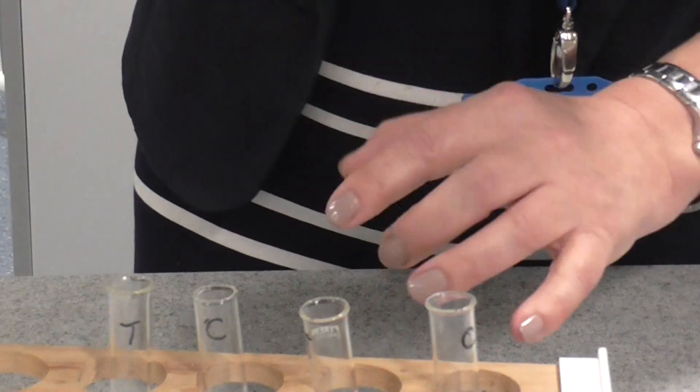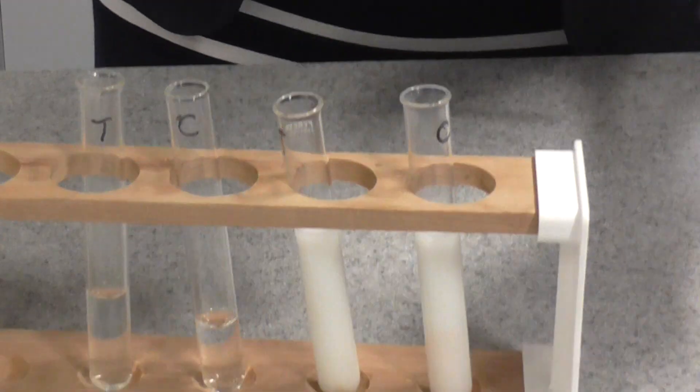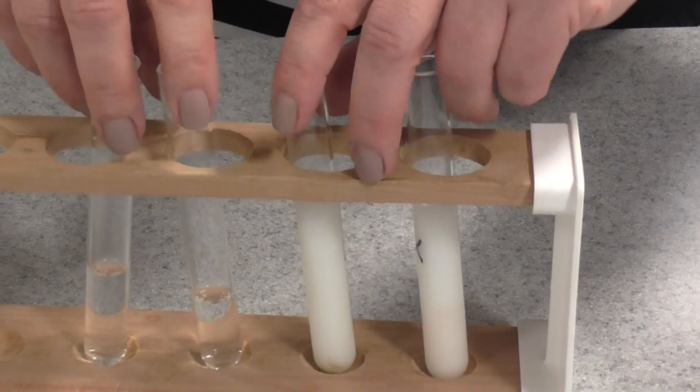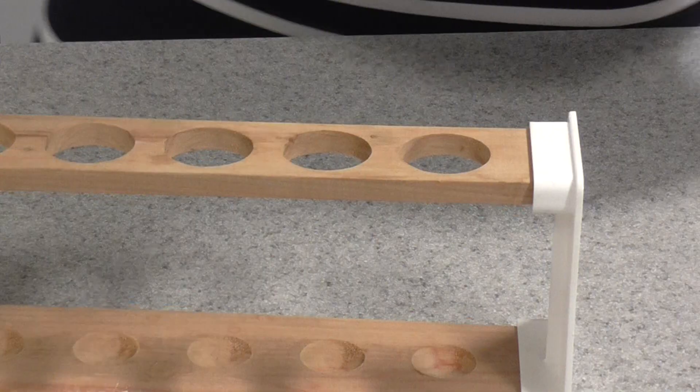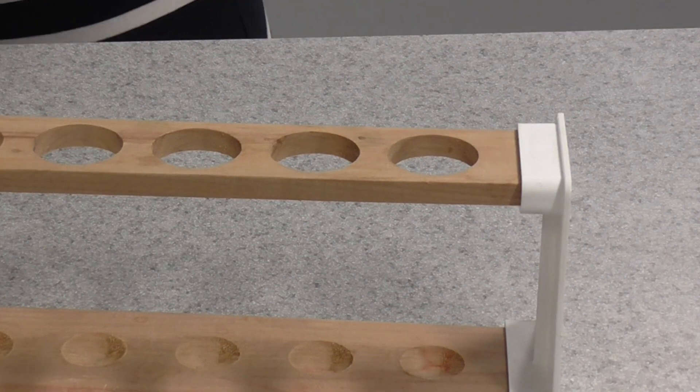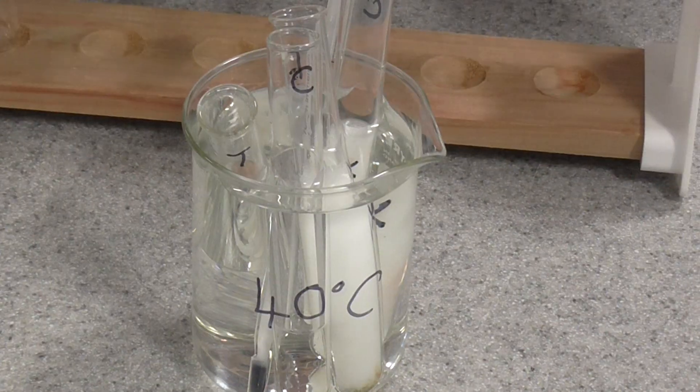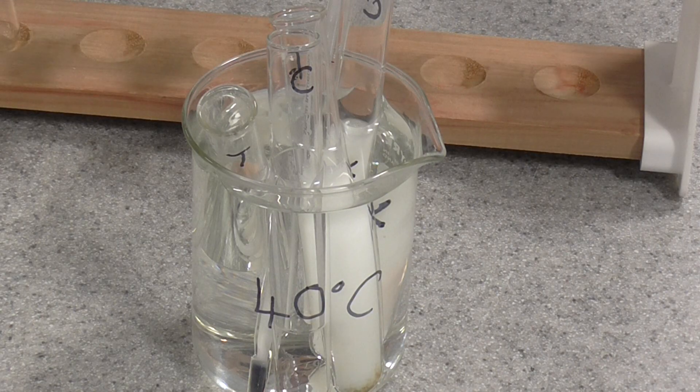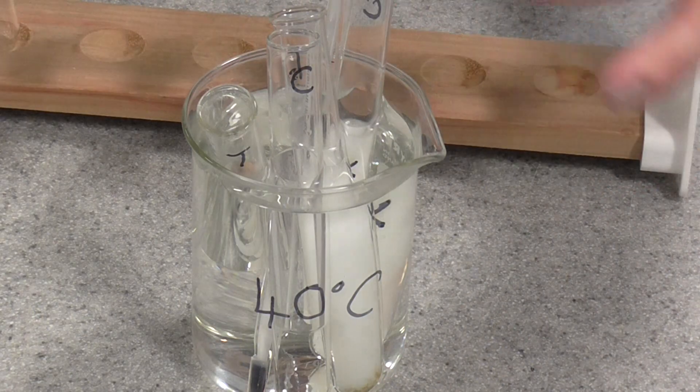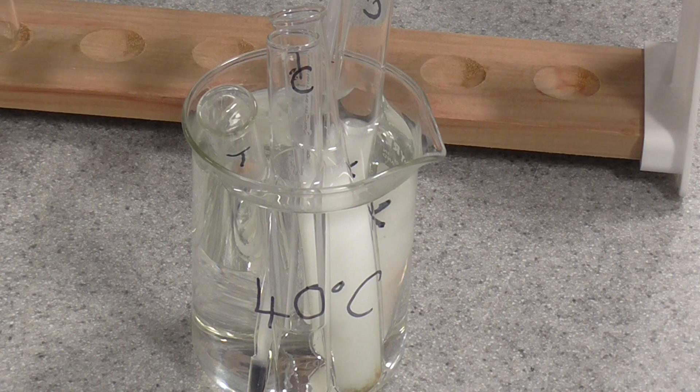Before we mix the enzyme and the milk, we need to make sure that everything is at the right temperature. So you're going to place these in the water bath, and you're going to leave them in there for maybe 5 minutes until they actually come to 40 degrees. You want all your solutions at 40 degrees before you mix them.